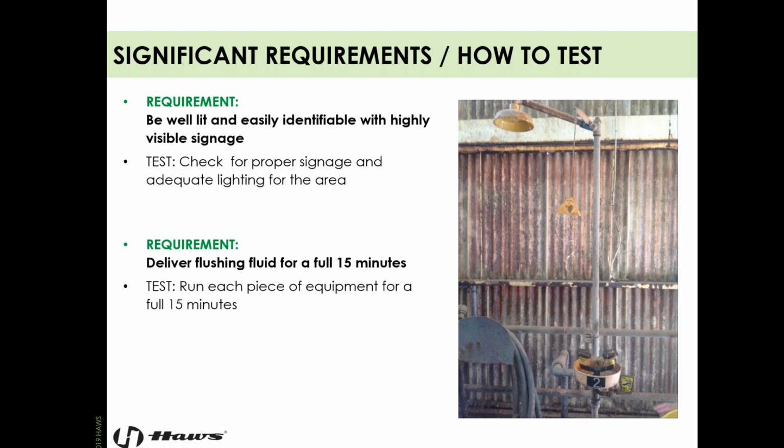That's pretty much the bare minimum when it comes to emergency flushing of your skin. If you look on the SDS sheet for just about any chemical, you're going to look in the first aid section, and it's going to tell you what it is that you need to do. You need to wash out your eyes, you need to rinse your skin, and it's going to tell you an amount of time, and that time at a bare minimum is 15 minutes. For more severe hazards and corrosives, caustics, other dangerous chemicals, if they get on your body, sometimes that time can go up quite a bit, depending on what you're dealing with, up to 30, even an hour, depending on what it is.